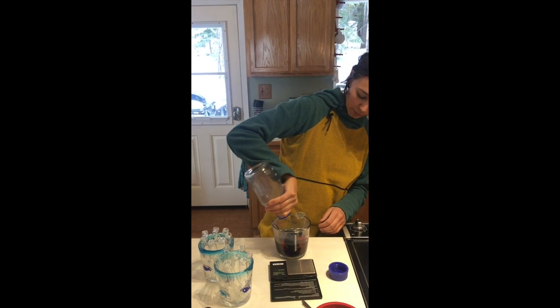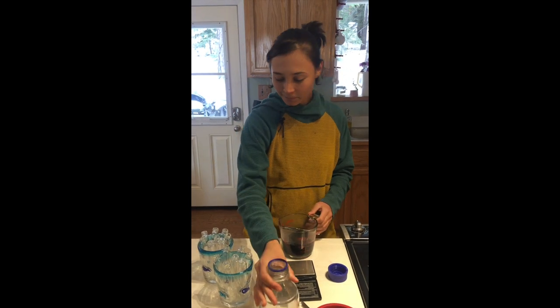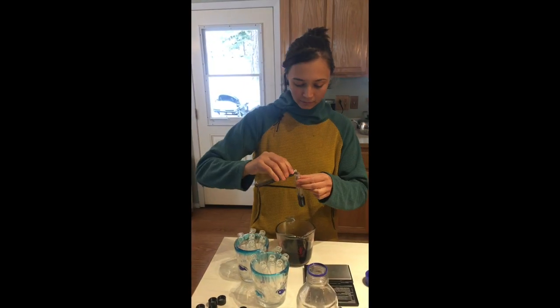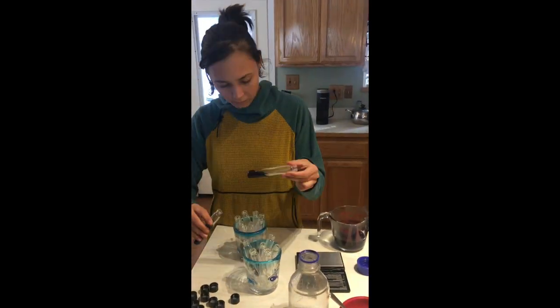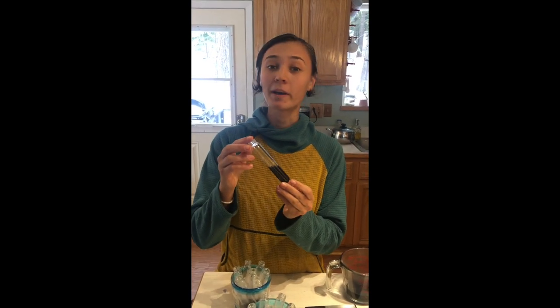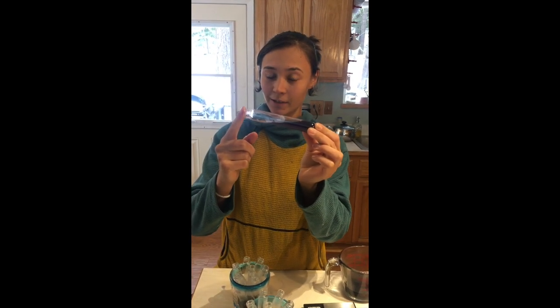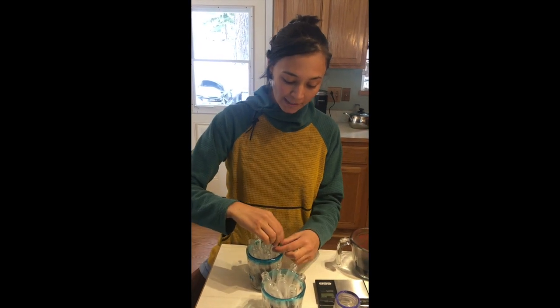After you let them grow out a little bit, you'd store them in the refrigerator. I'm gonna pour this into the test tubes now. The reason I'm not filling them all the way is because this is gonna turn into a slant — when it's cooling we're gonna set it at an angle, which allows for more surface area for the mycelium to grow on.